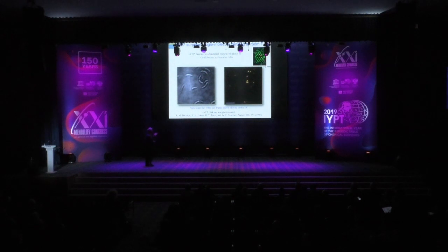What happens, though, if I just run the movie and show you what happens? It's amazing. These molecules are blinking. This was the surprise. We didn't expect this for fluorescent proteins at room temperature. So each one of these flashes of light is coming from inside of those bacterial cells. And the movie contains a great deal of information about all of those individual single molecules.